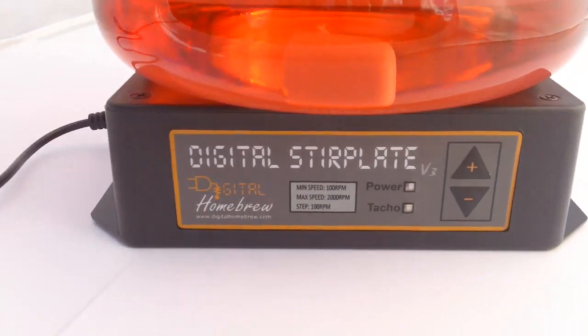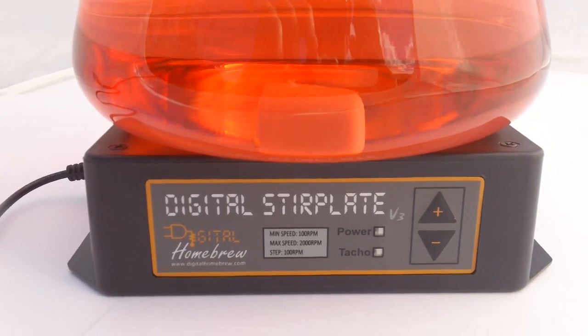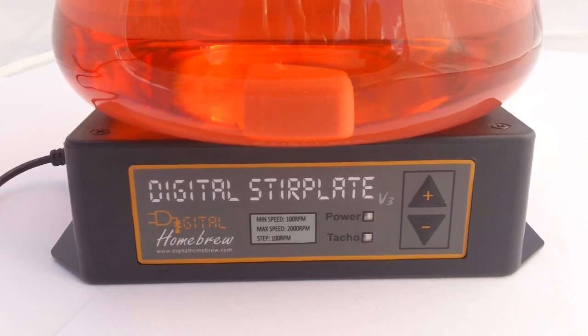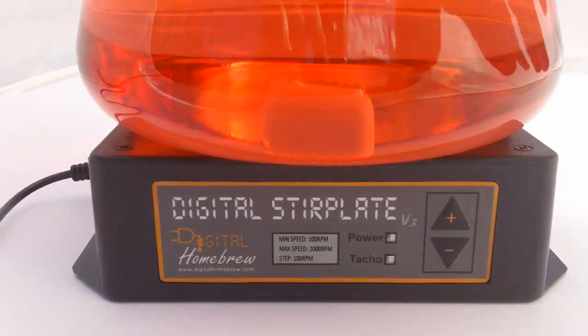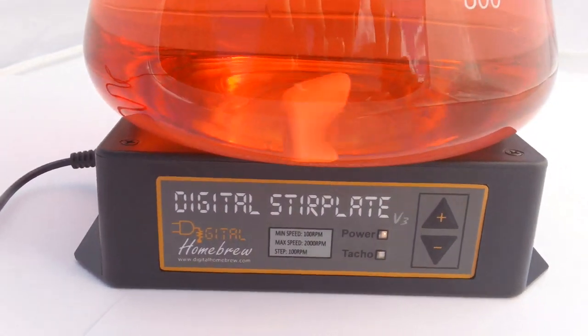The digital stir plate is a magnetic stirrer for homebrewers. Our take on the stir plate has a microcontroller in it that works like the cruise control in your car. You set a speed with our up/down interface — 1, 2, 3, 4, 5 — and it just holds that.